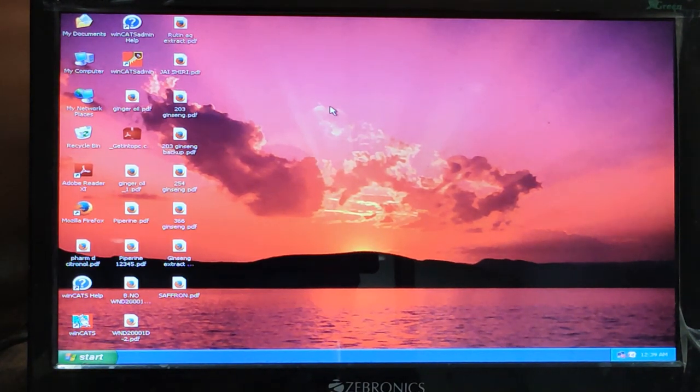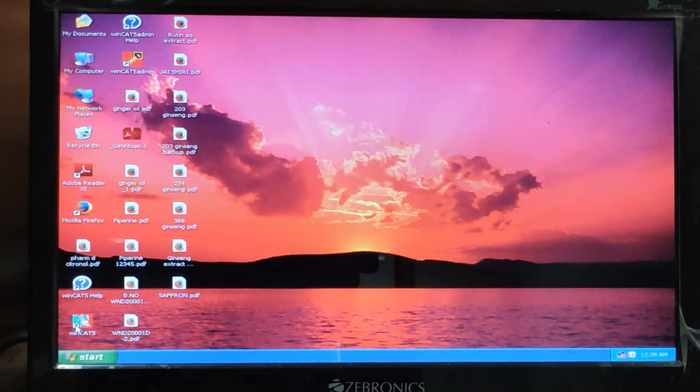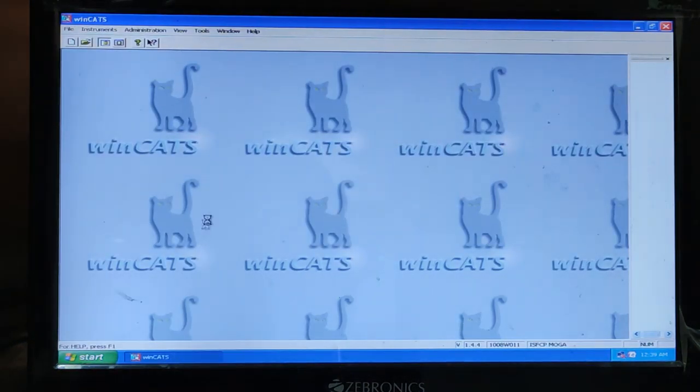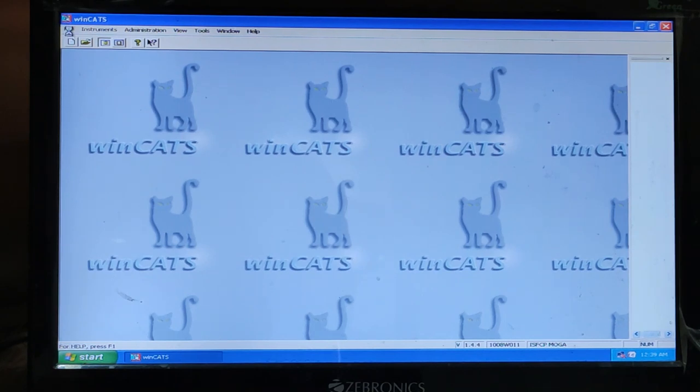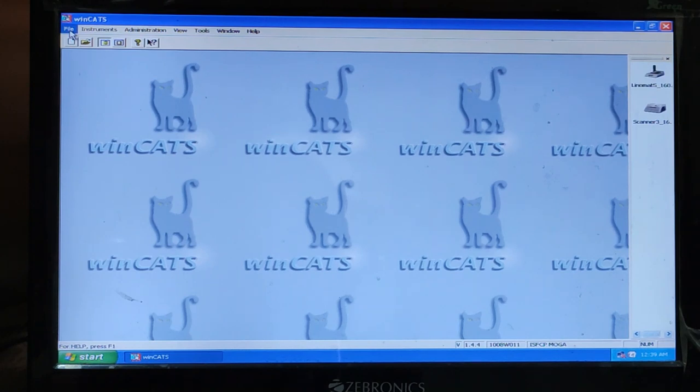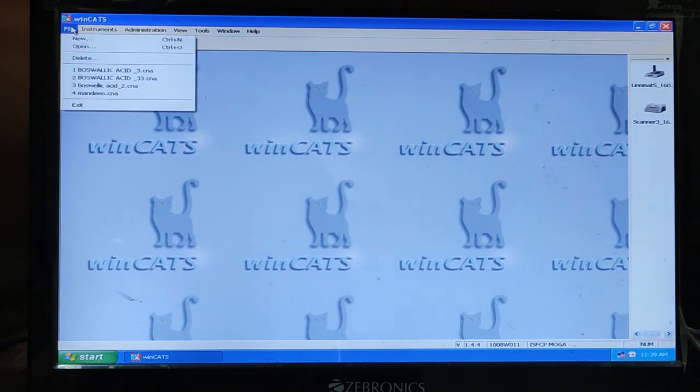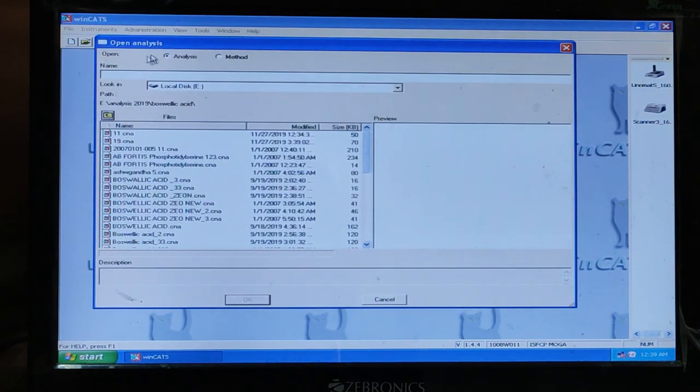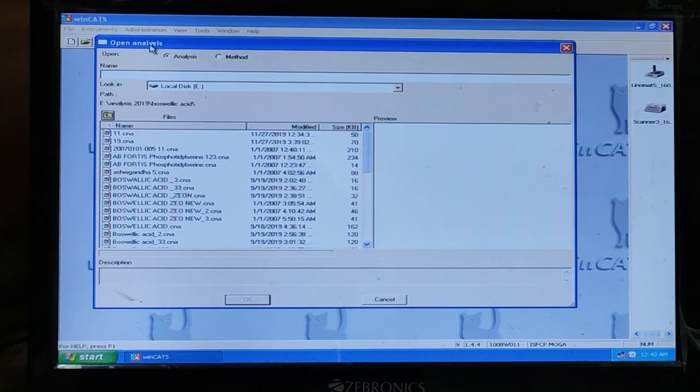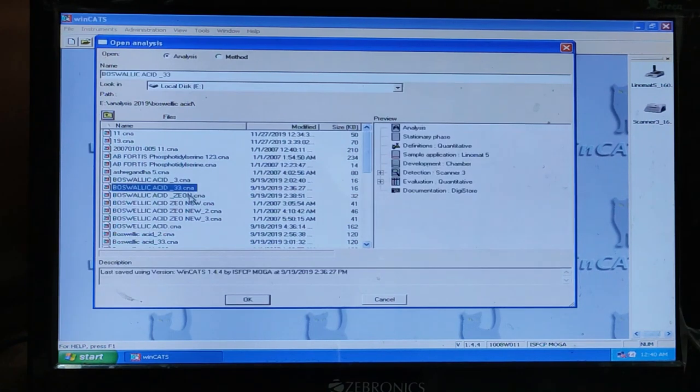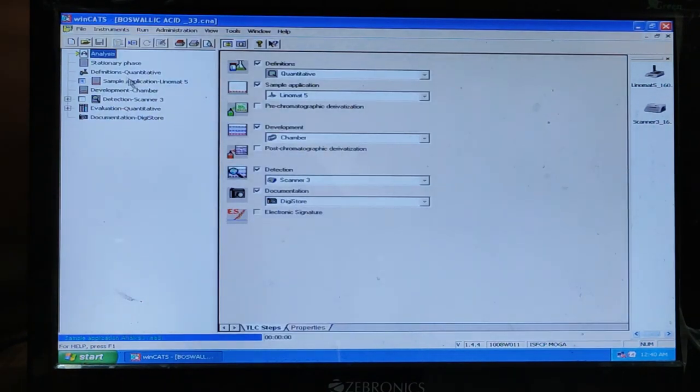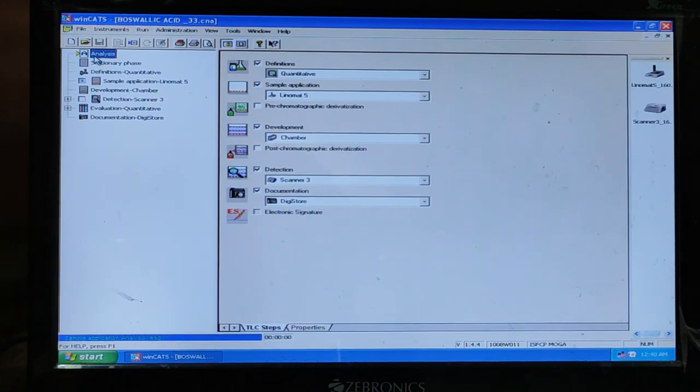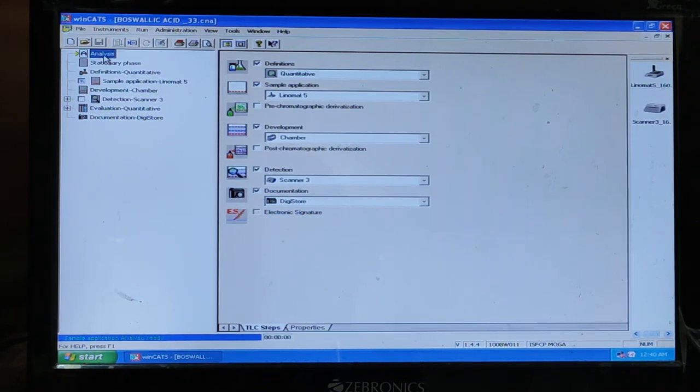So first click to WinCat. Here you can get the file in the top left. So just click open. You will get this open analysis. Click the method what you want. In the first top, you will get the analysis part.